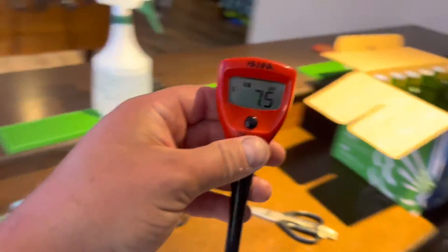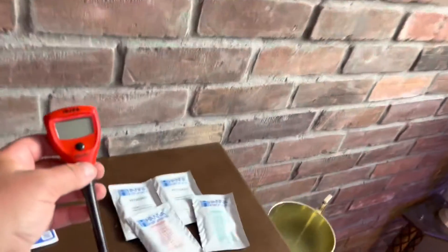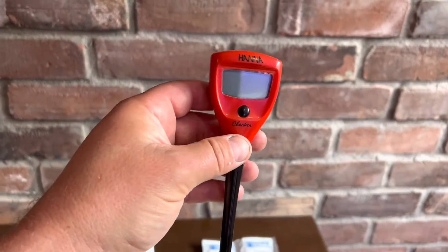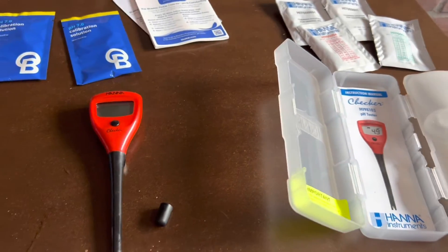When you're done with this bad boy, just push the button and it's off. What you can do is take the cleaning solution — which comes in here — put it in a little container and give it some dips. I'm not going to scrub it yet because it's brand new. Then when you're done, put the rubber cap on with a couple dabs of storage solution and put her back in.